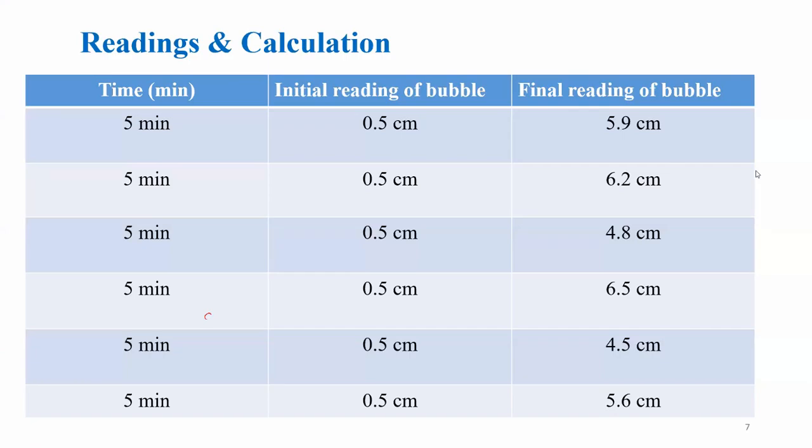So can you calculate the distance the air bubbles move during these 5 minutes interval?